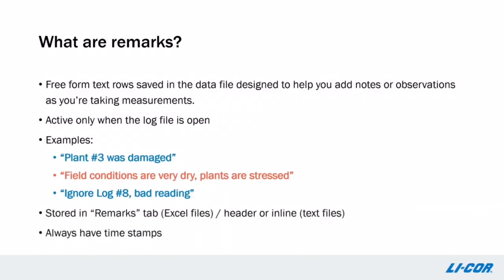Please note that in Microsoft Excel files, the remark is stored in the Remarks tab. For text data files, the remark may be stored at the header or in line with the measurements. Also, remarks always contain timestamps so that it's easier to associate a remark with a particular time or log event.